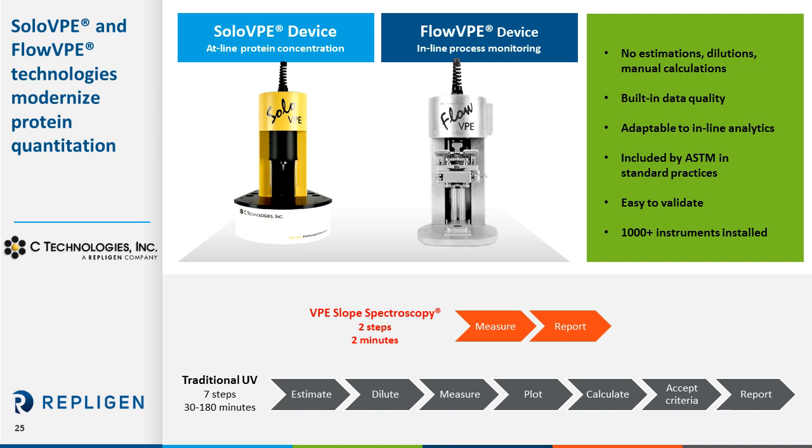I think we can all agree that if traditional dilution UV never existed and the 2 choices were given now, either here's a process that requires dilution, here's one that doesn't, I don't think anyone would choose the method that requires the dilution.